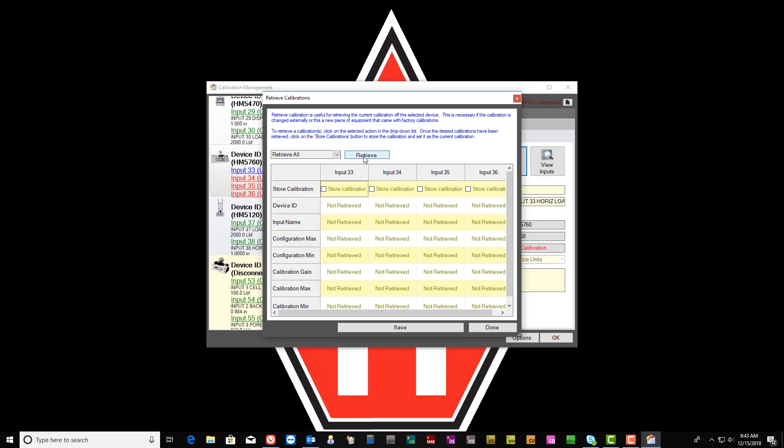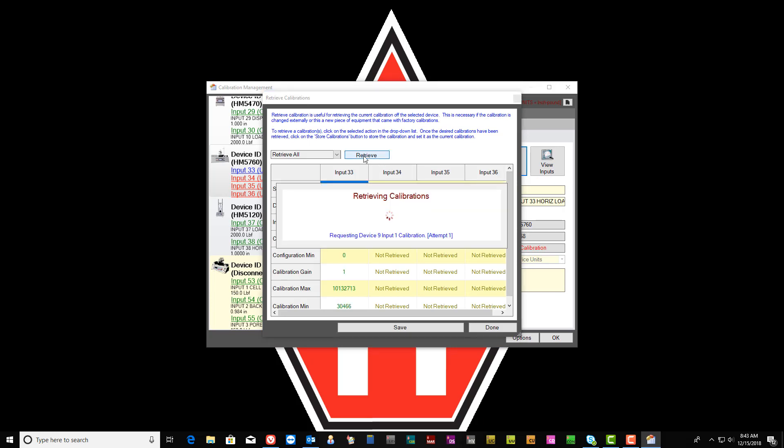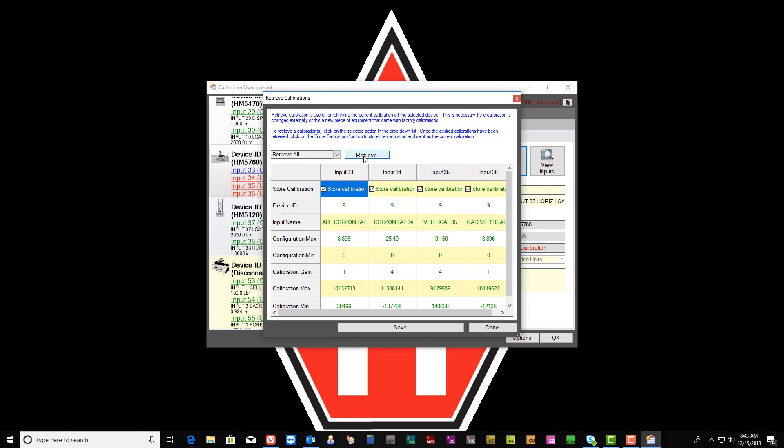By default, it will be Retrieve All and then select the Retrieve button. You will see that all the data for each sensor for that instrument will import and populate into the appropriate rows.